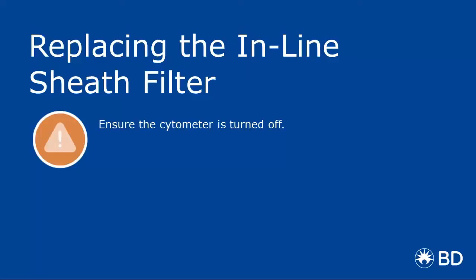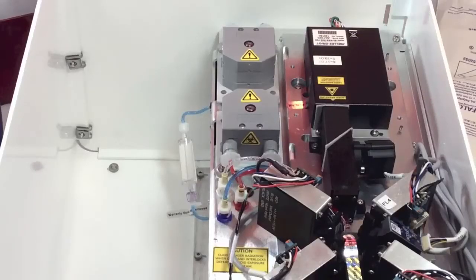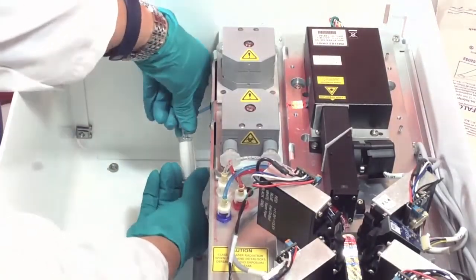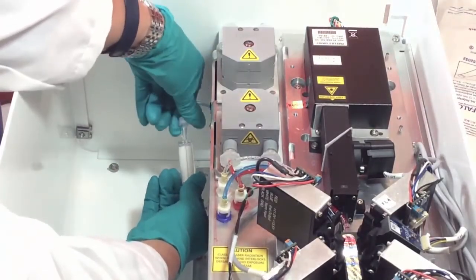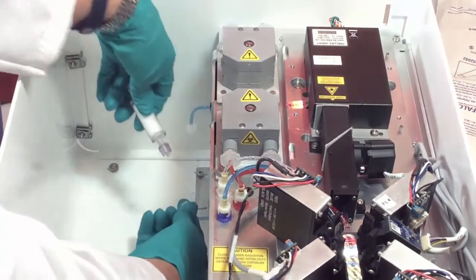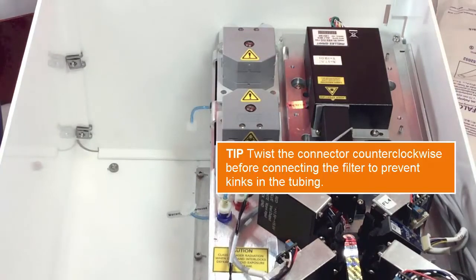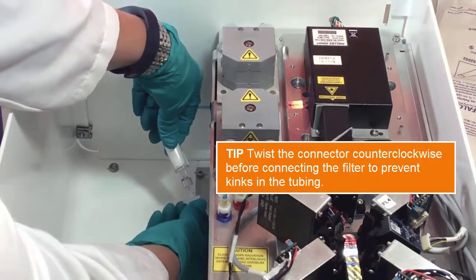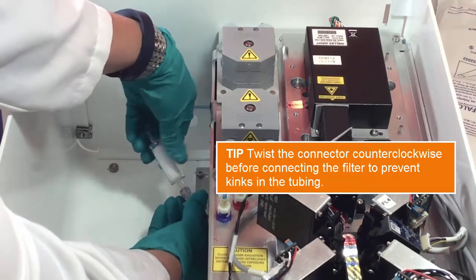Next, we'll cover the procedure for replacing the inline sheath filter. Twist the luer locks on both ends of the inline sheath filter to disconnect the locks, and then discard the filter. Install a new inline sheath filter by reconnecting the luer fittings. Make sure you write the date on the filter, that way you'll know when it was changed last.